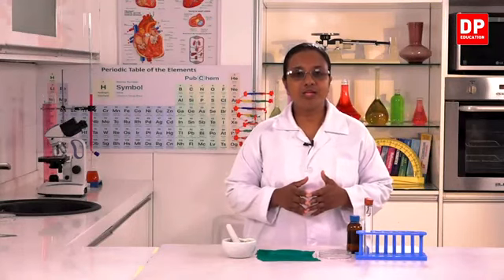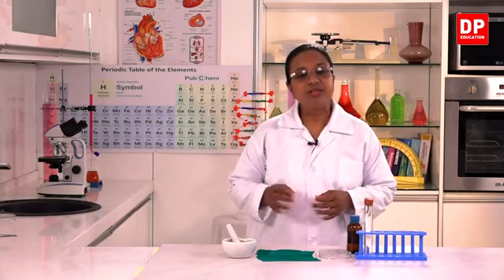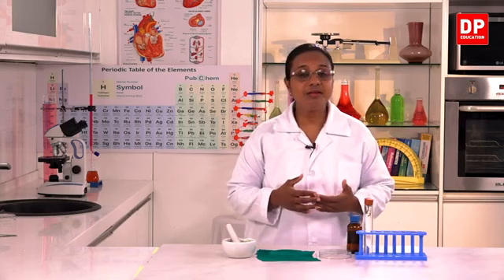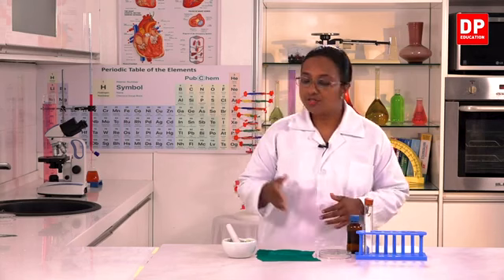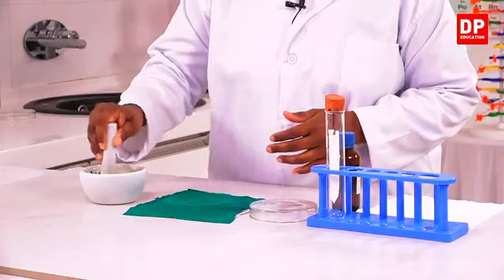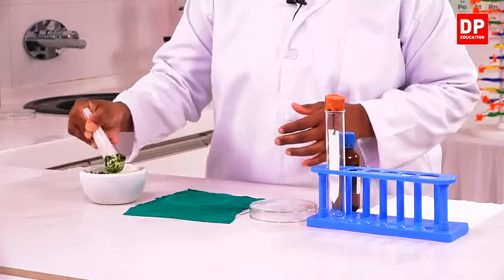So now I am going to demonstrate the chromatography technique. We will see how chlorophyll, the green pigments present in leaves, are separated using this method. For that I have already ground some leaves. These are ground leaves. From that I have to take the juice.